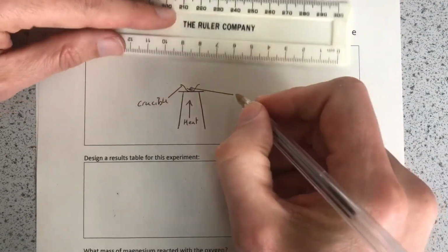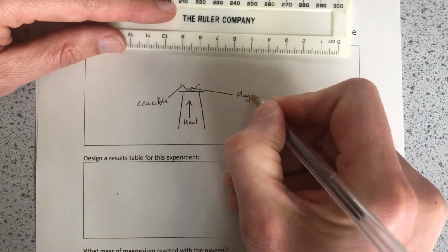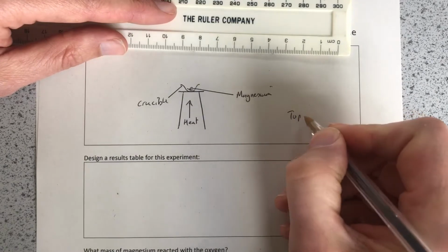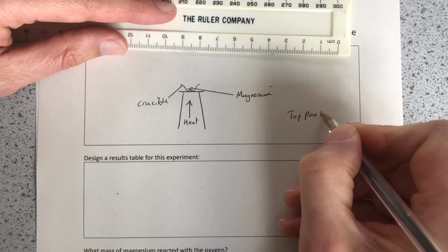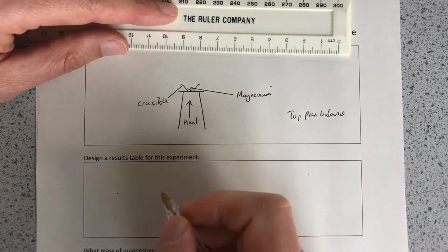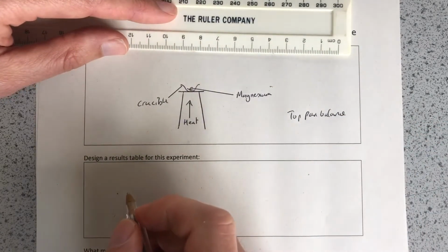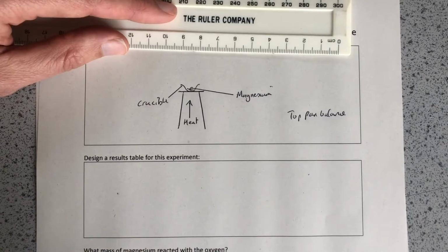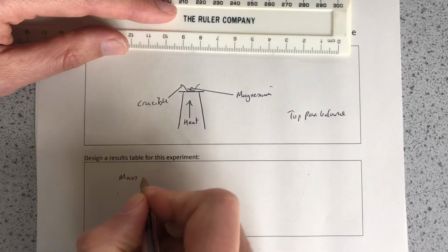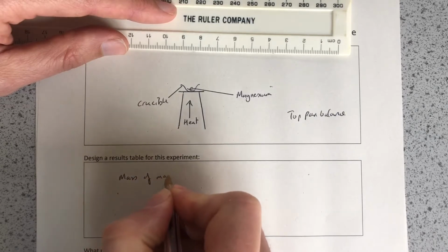Now the important thing is we're going to take lots of measurements as well, using a top pan balance. We're going to need a top pan balance. You're going to need to know exactly how much magnesium we're going to use, and then we're going to need to know how much magnesium oxide is made, and from that we can work out how much oxygen, and they are the readings we need to calculate an empirical formulae. So, the readings, we're going to need mass of magnesium.